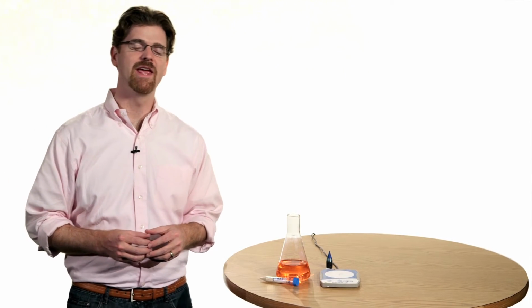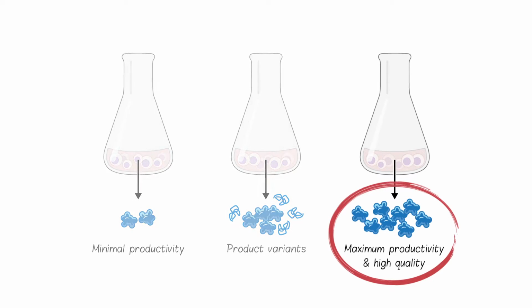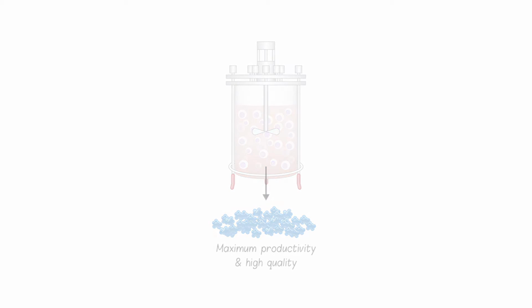Before we dive into the mechanics of a bioreactor and its operation, we should first examine the fundamental process we want to support in it. As we've discussed, our clonal cell line has been engineered to express our biologic protein of interest. The basic role of the bioreactor is to provide the care and feeding of the cells so that they make as much high-quality product as possible. So let's break down the essential elements in this process.